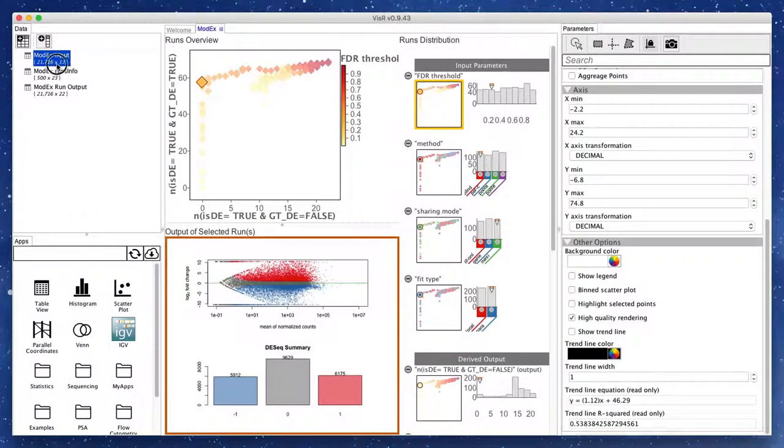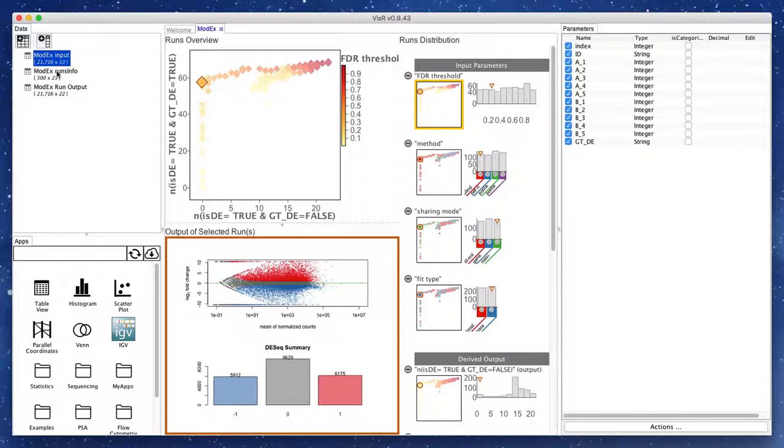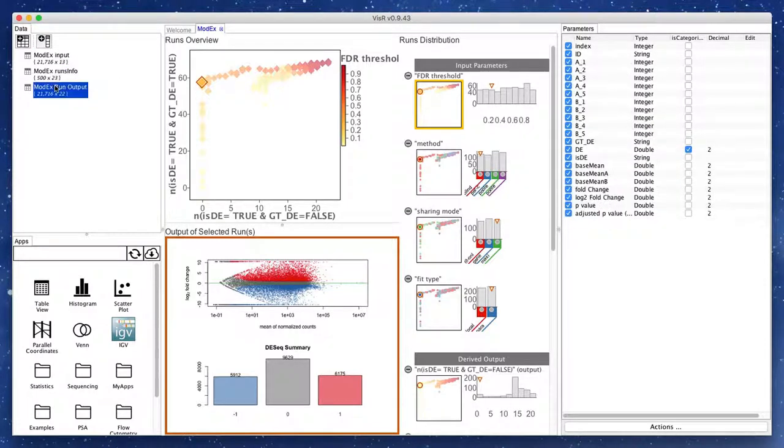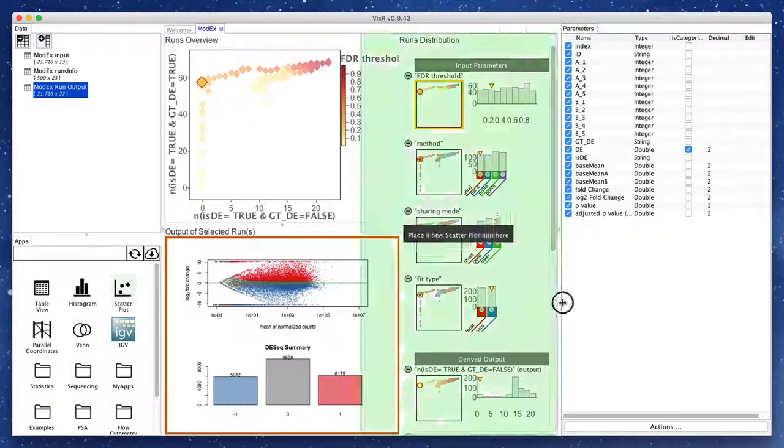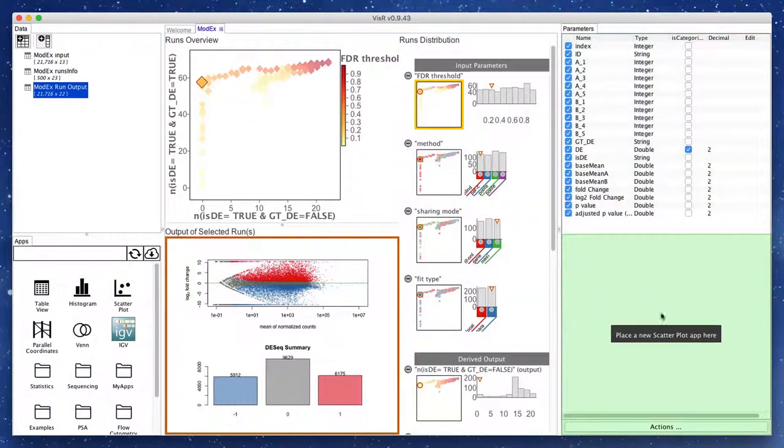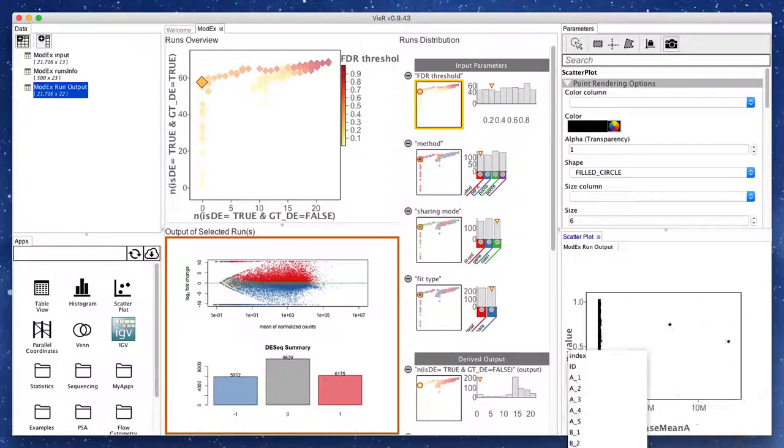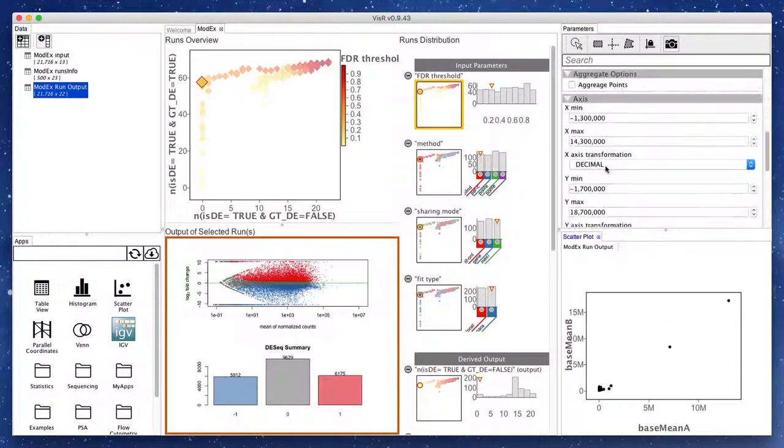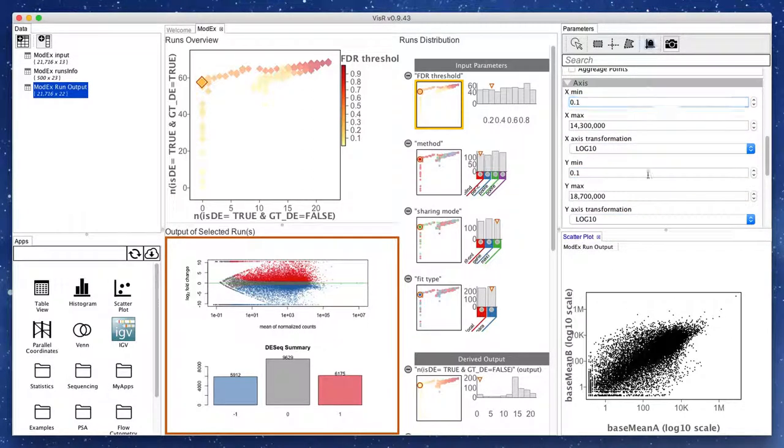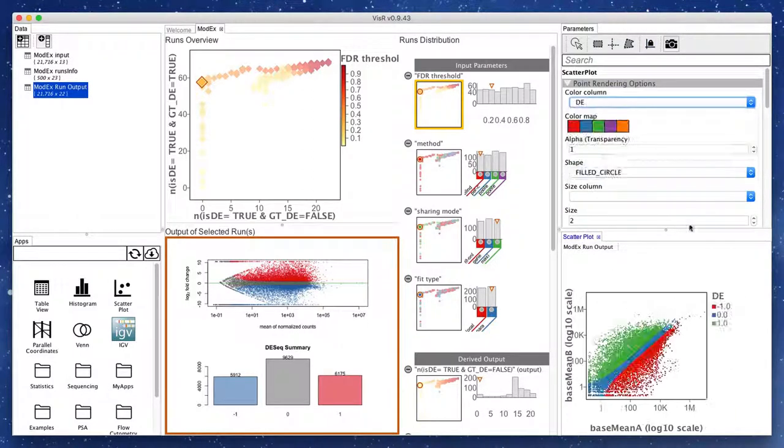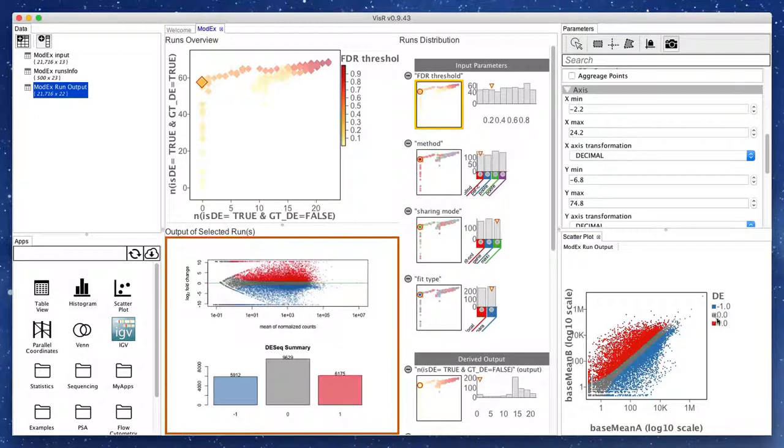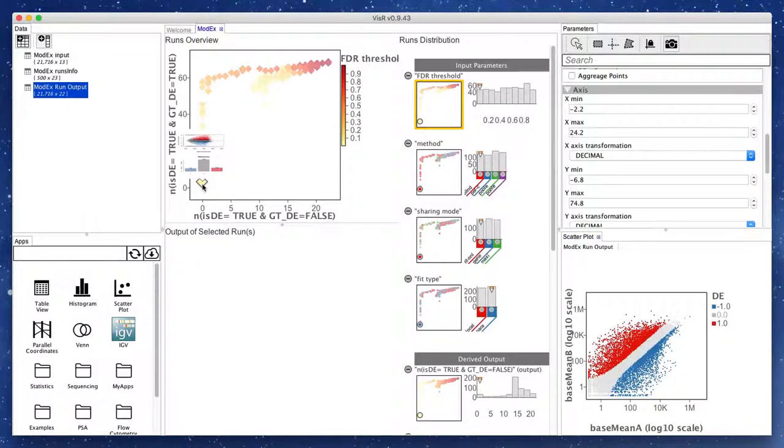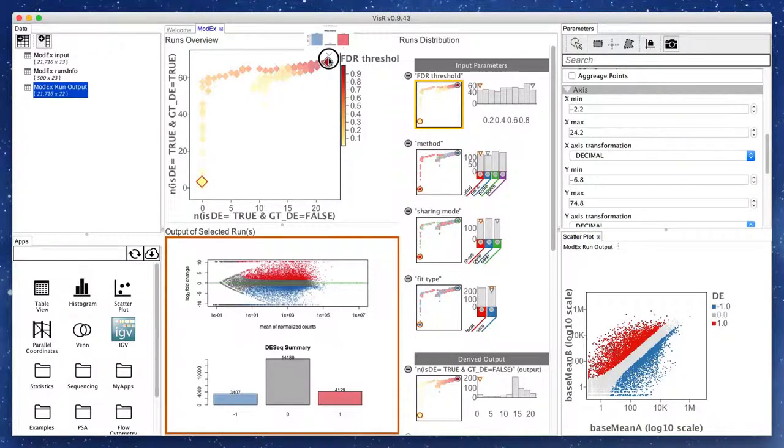As we interact with the runs, the run output table is also updated with the output of the selected run. This allows us to extend and enhance the default workflow by linking other apps as needed. Here we use an interactive scatter plot and set it up to show the gene activations colored by the detected DE state. So as we select different runs, the interactive scatter plot will also refresh accordingly.